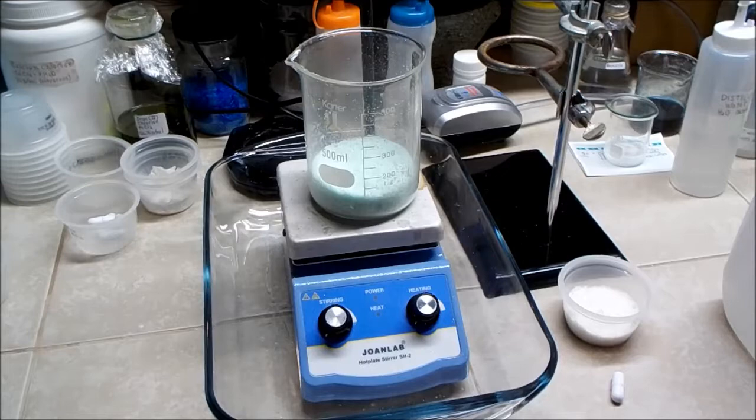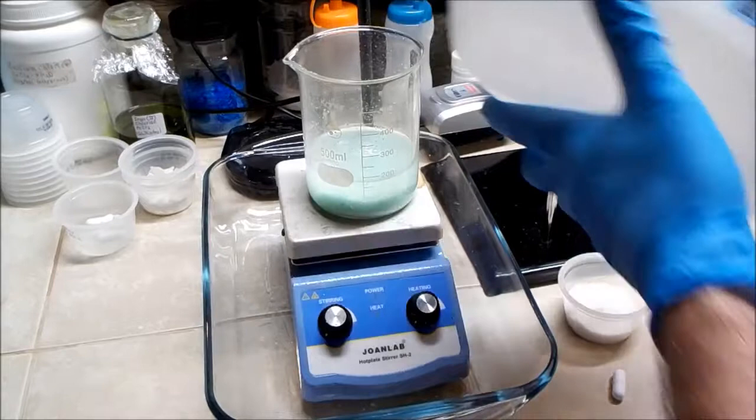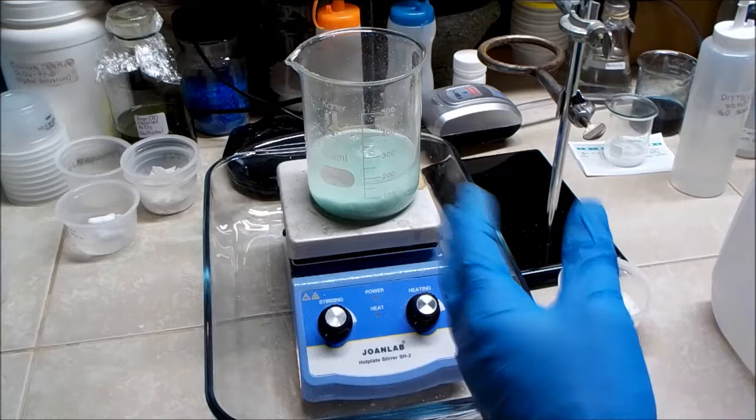Alright, so I'll just add some distilled water to the iron sulfate. The only reason I dried it out was so I could weigh it accurately. Otherwise, I wouldn't have even had to have dried it into a powder. So I'm going to start off with a fairly small amount of water.